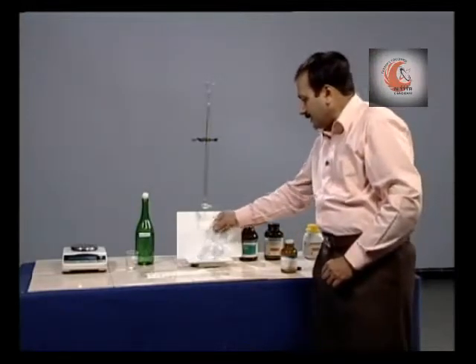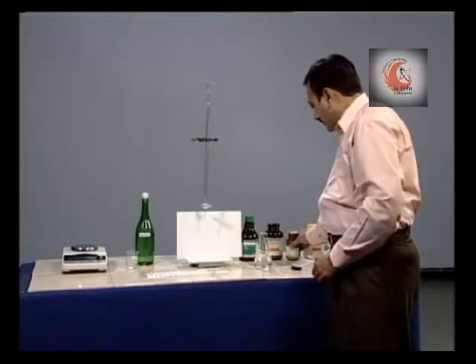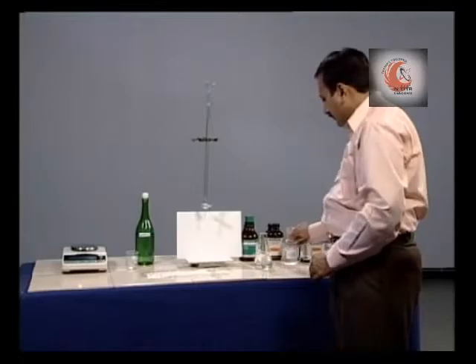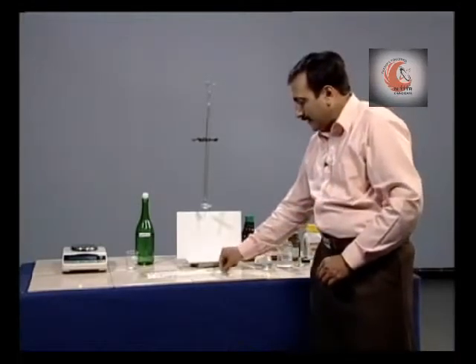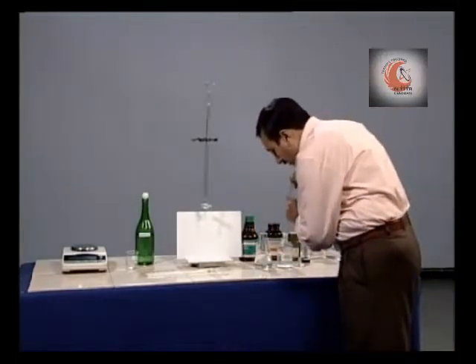Now, we will add starch solution. Dispense 1 ml of the supernatant.